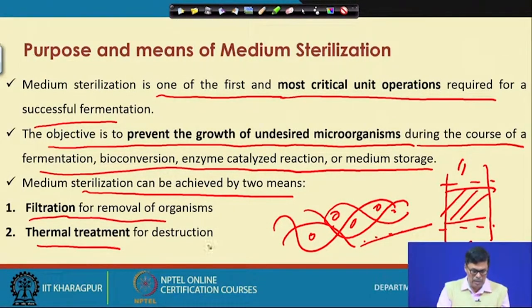Now, in the case of media, since the medium is a good conductor of heat, we consider heat the best means for sterilization of the medium, but not like air sterilization, because, as I mentioned, air is a non-conductor of heat. That is why we consider the filtration technique for air sterilization. In the case of medium sterilization, since it is aqueous, water based, and water is a good conductor of heat, we go for the thermal sterilization process.